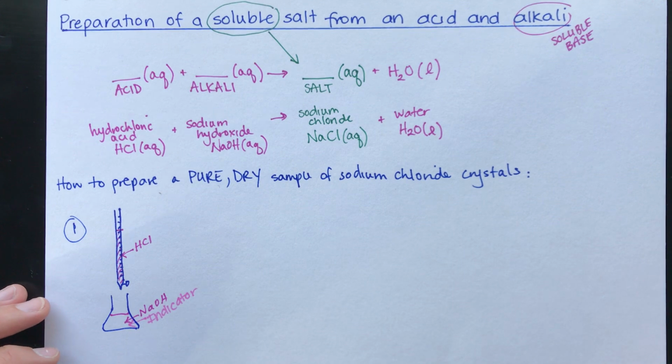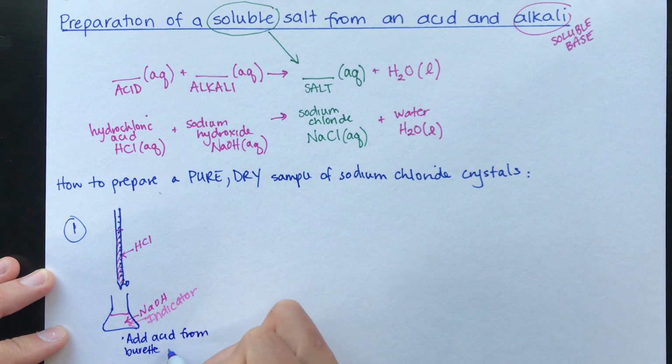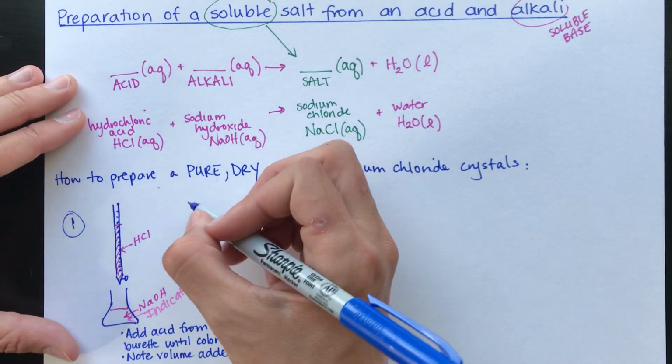Okay. So our steps here would be add acid from burette until the color changes. And importantly, you need to note the volume. And the reason you need to note the volume is we have a problem. Say we've perfectly neutralized our NaOH, so great, we've got no leftover acid and alkali, but we've just contaminated it. Our sample's not pure because we've added all of this indicator to tell us when the base was neutralized. So once we've done this whole wonderful reaction, we need to do the whole thing again.